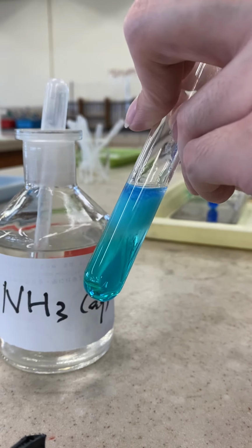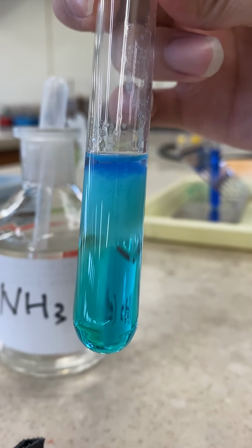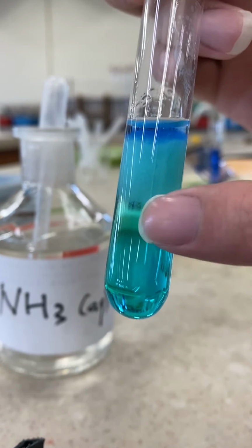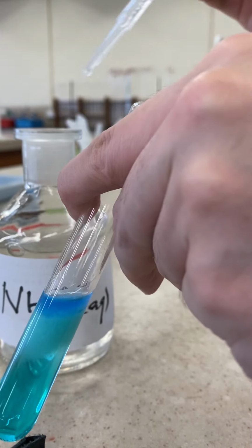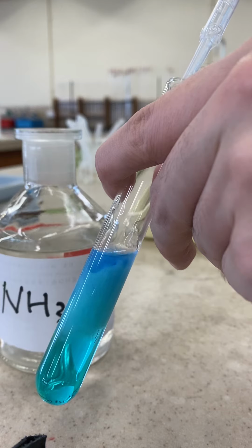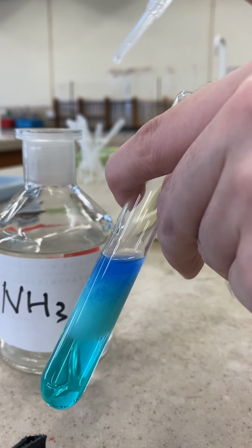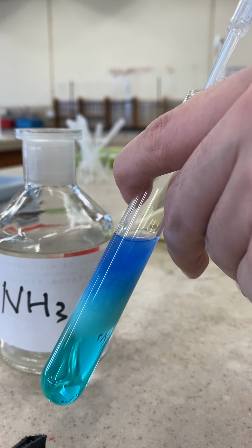Is it something familiar? Yes, in the copper-2 sulfate solution, when you add ammonia, you also see this pale blue precipitate. And let's guess, what if I add more into it? What is the color? And this time I don't want to shake it, because it may be more beautiful.